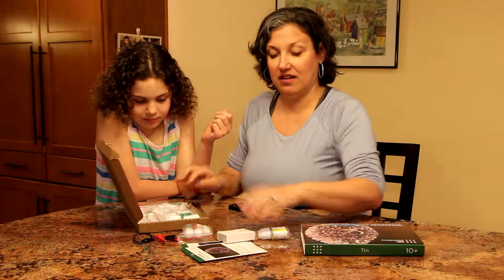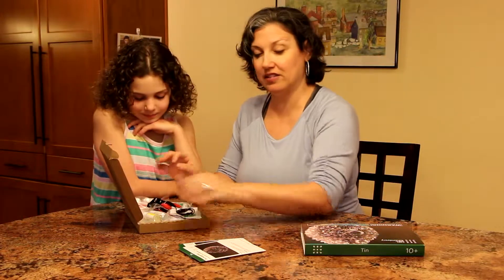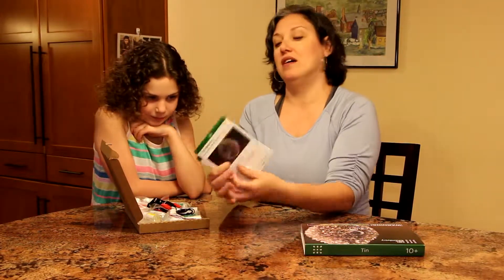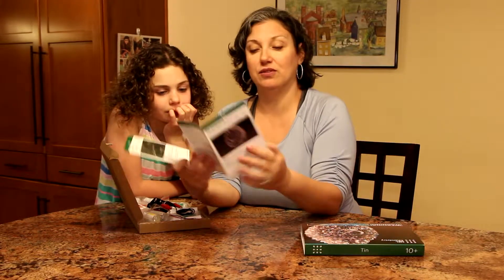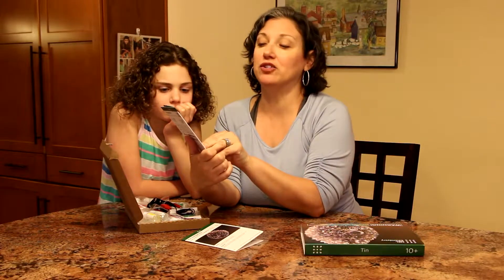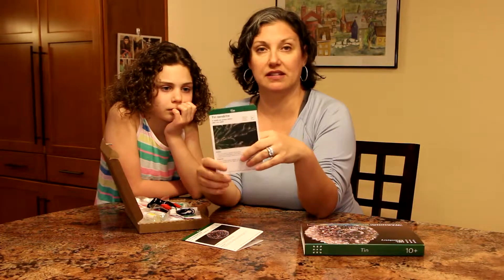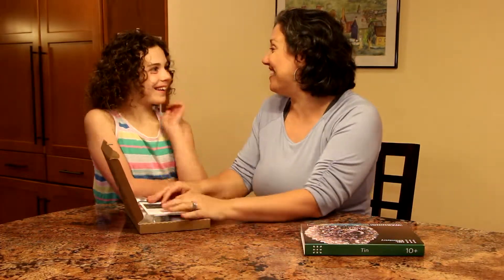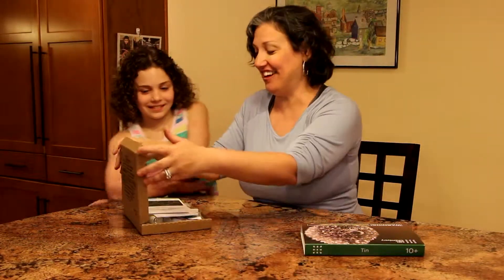And then we're going to come back and make a new video to show you how to do this project. We'll be studying up on how to do this. They also give you little cards explaining the two types of things we're going to make. We're going to make a Tin Hedgehog, where a zinc pellet turns into a little hedgehog. And we're going to make a Tin Dendrite, which is a metal tree that grows before your very eyes. So it's like making crystals basically using tin. Won't that be fun? Give me five! We're going to have so much fun with this.